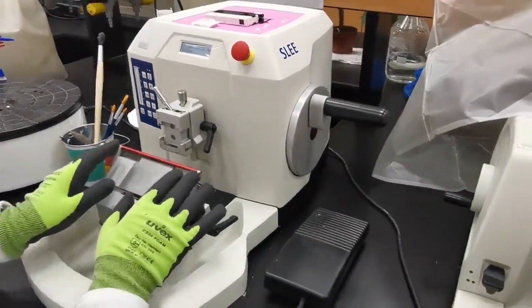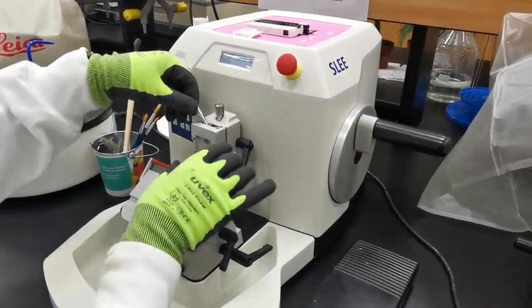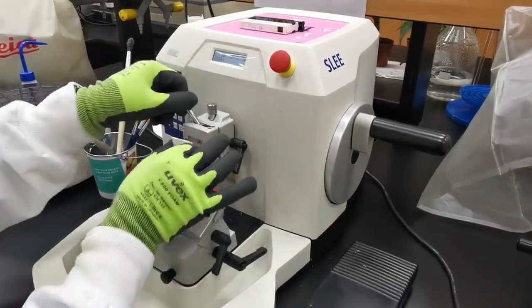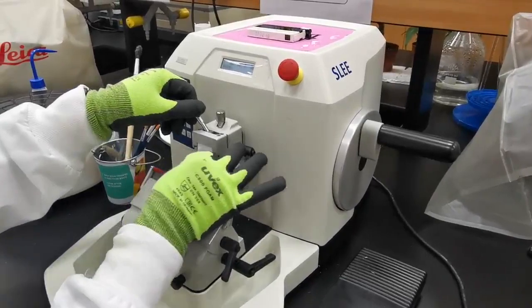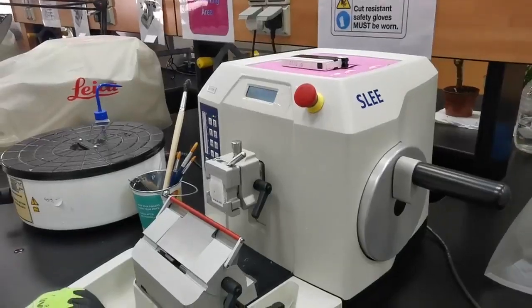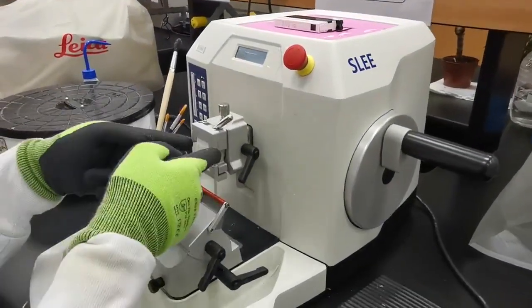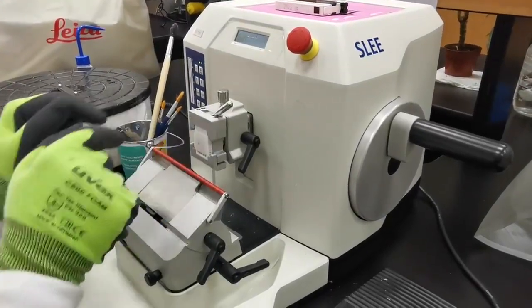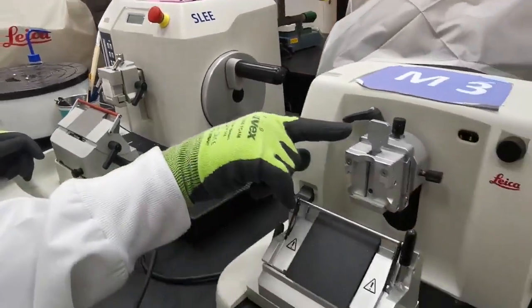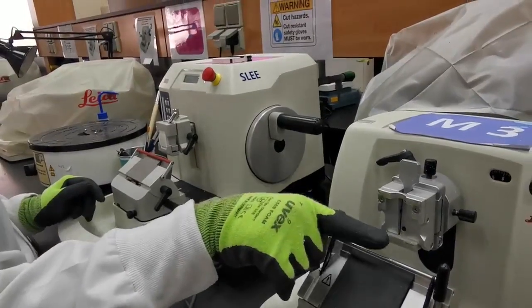Regarding the block holder, it's also the same idea. You can place your block and tighten it here, and it will be held in position. We can also control the tilting and facing of the block toward the knife, using the same mechanism that was in the rotary microtome.